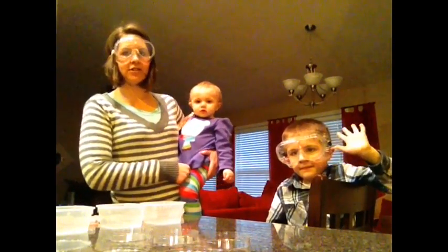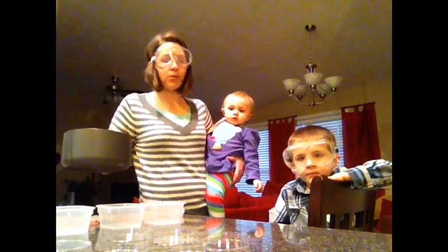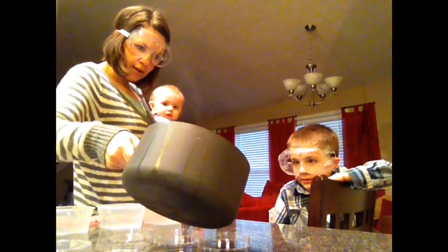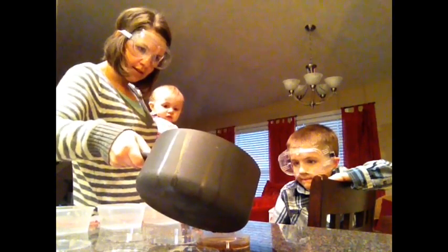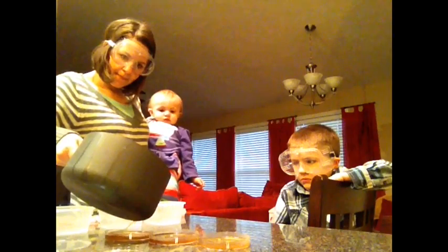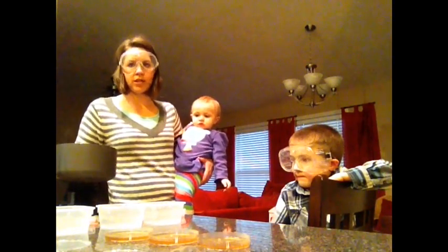We are back and now we've added another scientist to our group. We've let our liquid solution cool off — actually a little more than five minutes. Now what we need to do is pour it into our petri dishes. You're going to pour it about two thirds full. This makes a lot of liquid, so I'm going to pour it in here and also fill up my four Tupperwares.